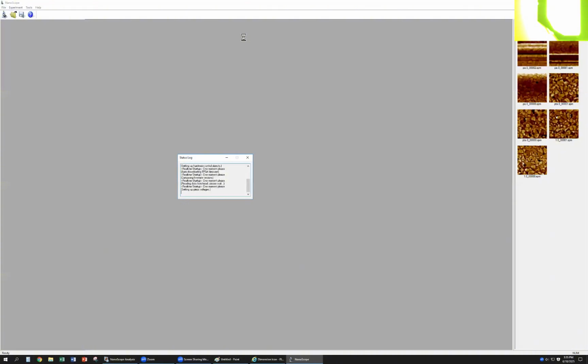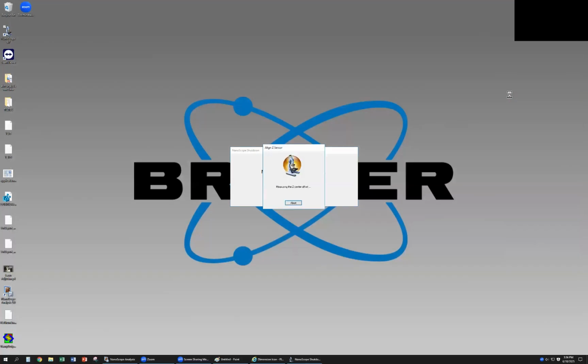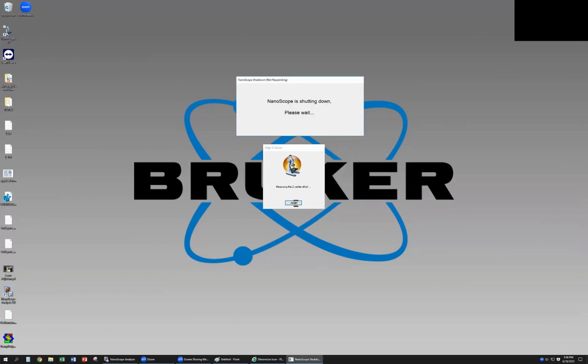So if the backside of your cantilever has a coating layer, for example aluminum or gold or something, then the signal sum will be higher. If you use a probe with no coating layer, this sum will be a little bit lower, around 1 to 2. Then if you have the coating, you can get 3 or 4. Okay, so that's the signal sum.